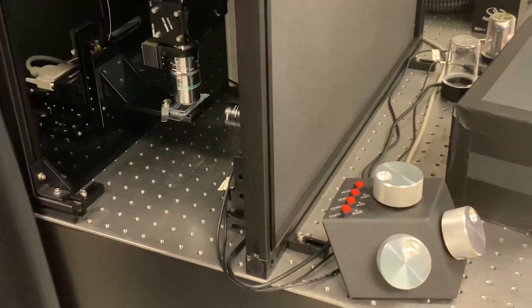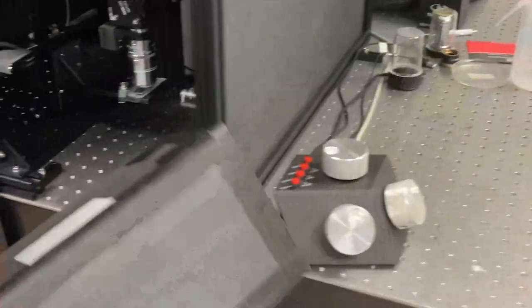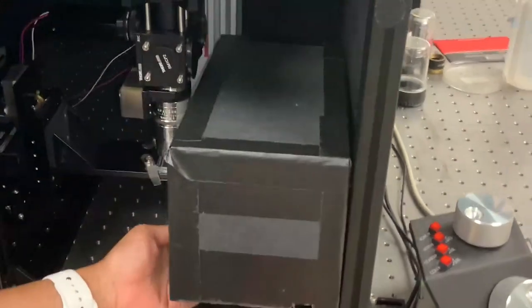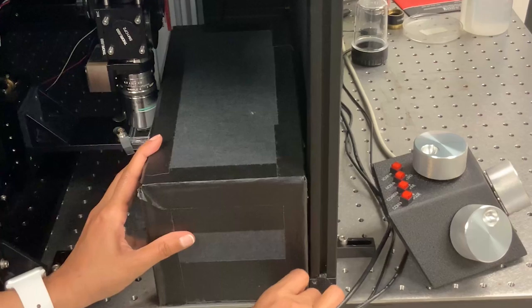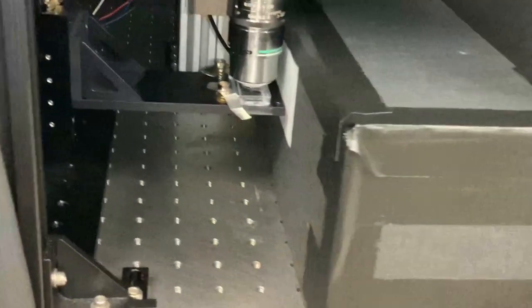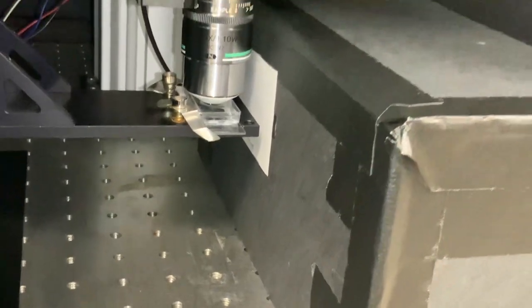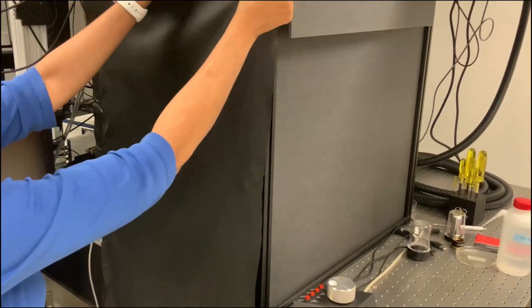Images are projected onto a diffusive screen positioned a few centimeters from one eye. To prevent contamination by stray light, the projector is enclosed in a light-tight box, as shown here. To prevent light contamination from the computer screen and other light sources in the room, the entire microscope is housed in a light-tight enclosure.